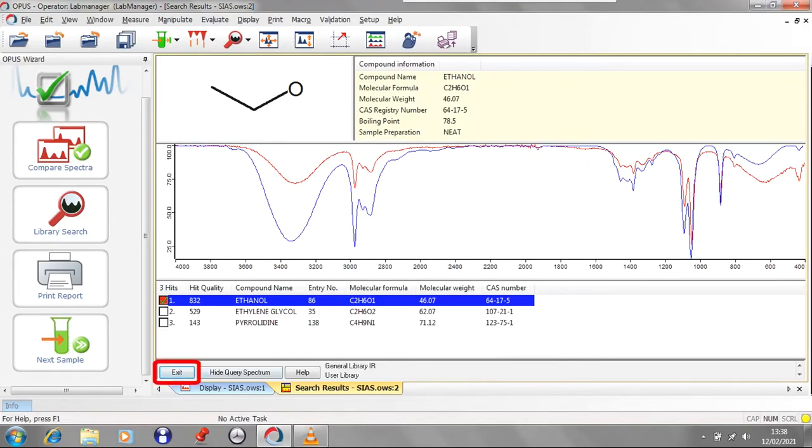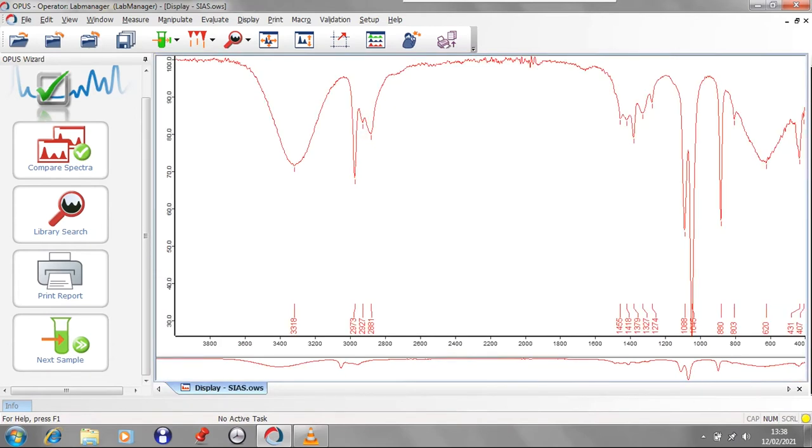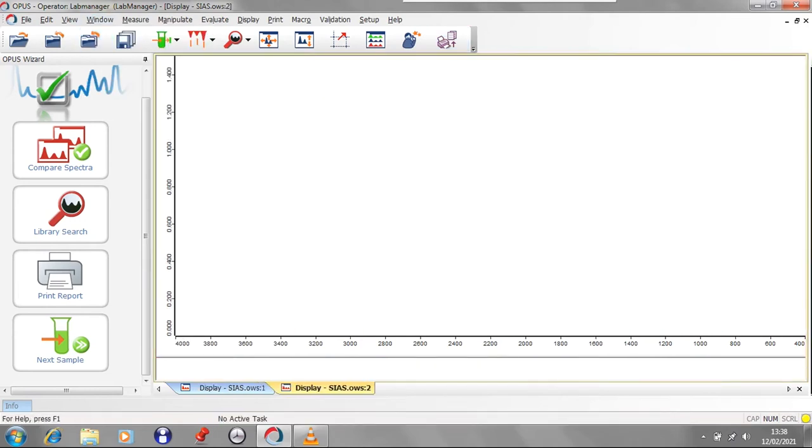To leave library search, hit the Exit button in the lower left-hand of the library scheme. To start a new sample measurement, you will need to clear the previous spectrum or, as we show here, open a new one. Clicking on New Spectrum Window will open a brand new window while retaining your previous spectrum. You can right-click on a spectrum window and just remove it from the display. When you have your blank spectrum window, you can click on Next Sample to begin your sample measurement.